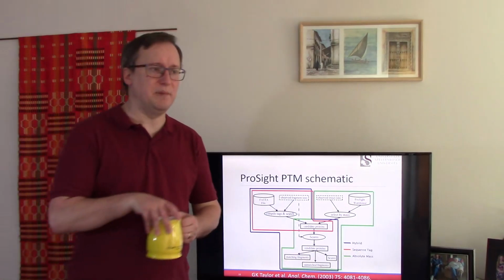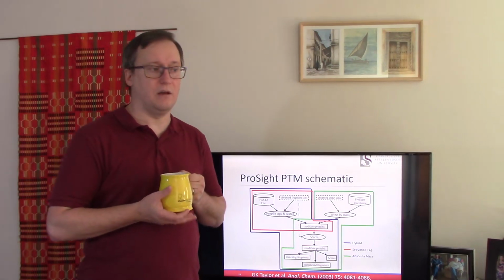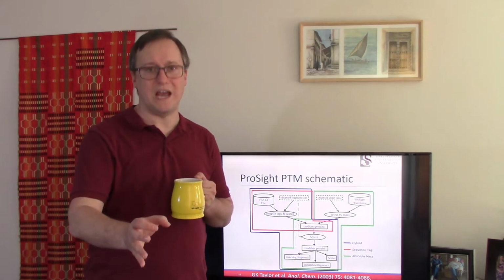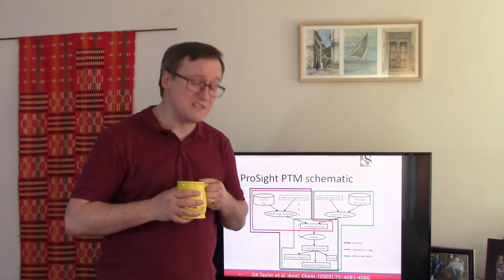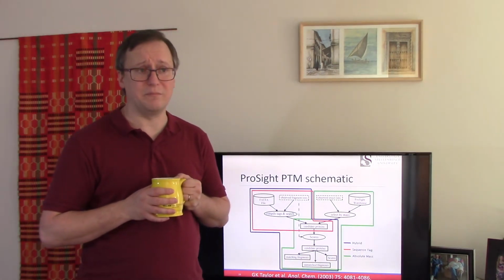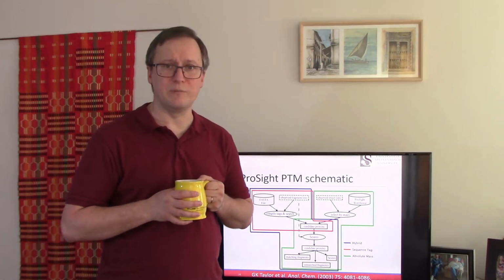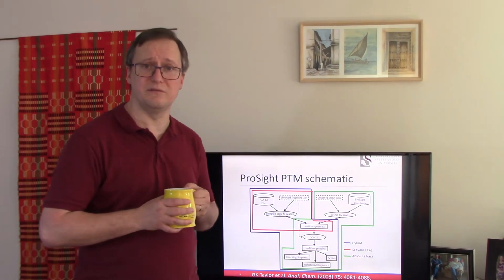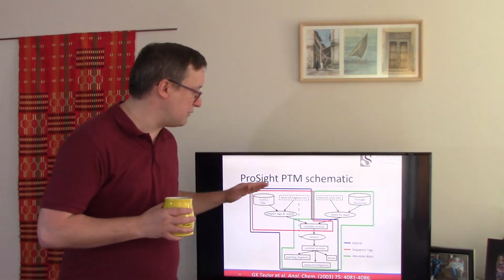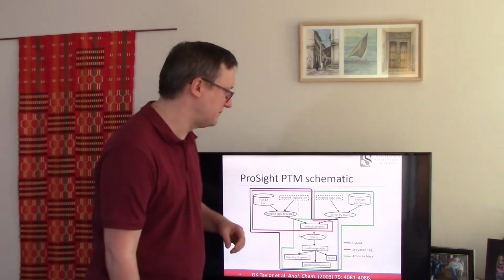All right, so ProSight PTM is one of the most widely used, best marketed, good training, long-standing development toolkits out there for top-down proteomics. It's an impressive piece of software. It is not the only one we're going to talk about today, but it's one you should definitely know about because in a lot of ways the toolkits for top-down proteomics that are most mature, those that have had the longest to marinate, are the ProSight toolkits. So I wanted to talk about its three-way search assessment ability.